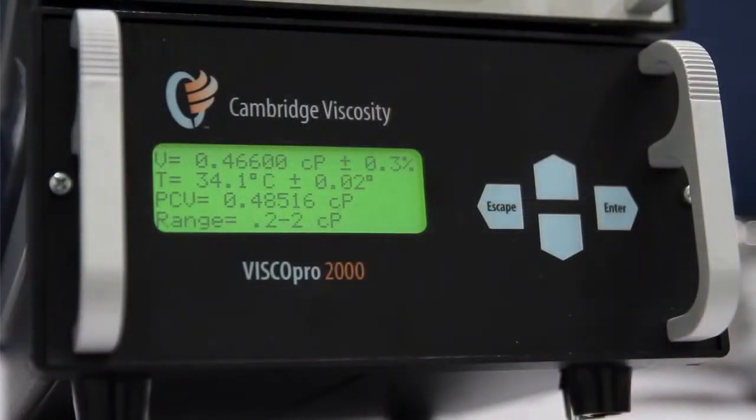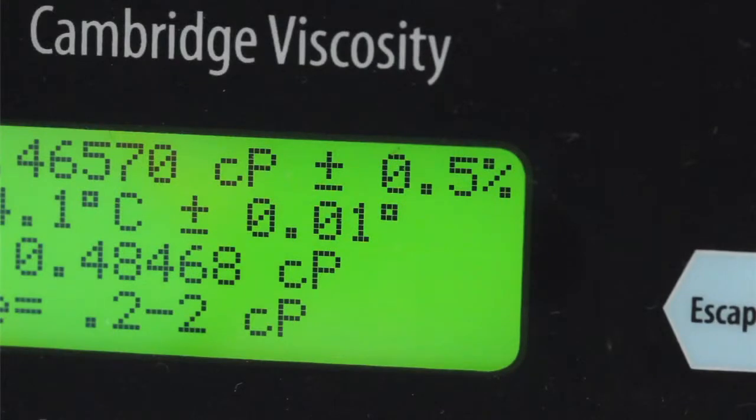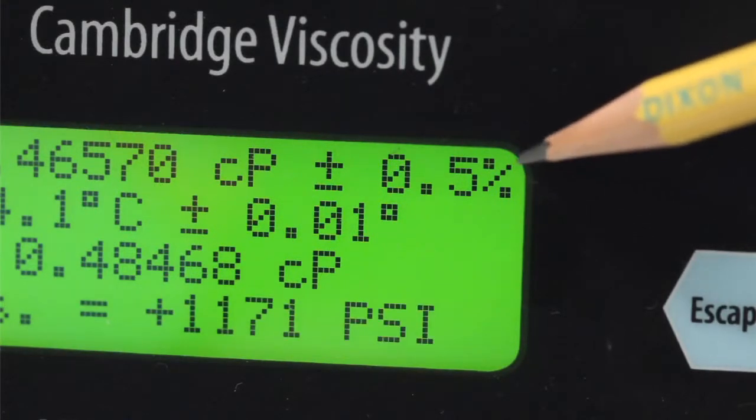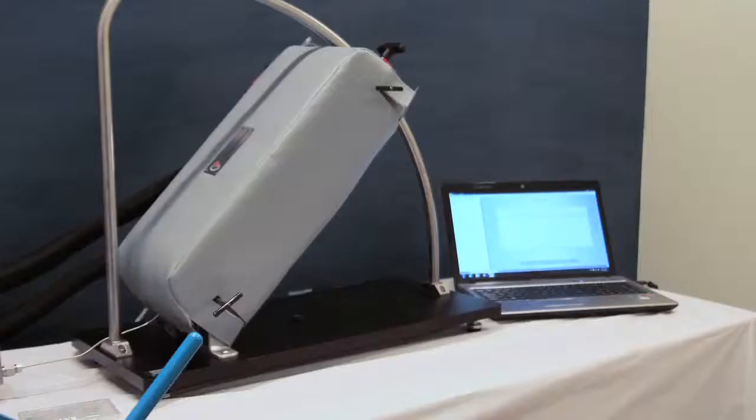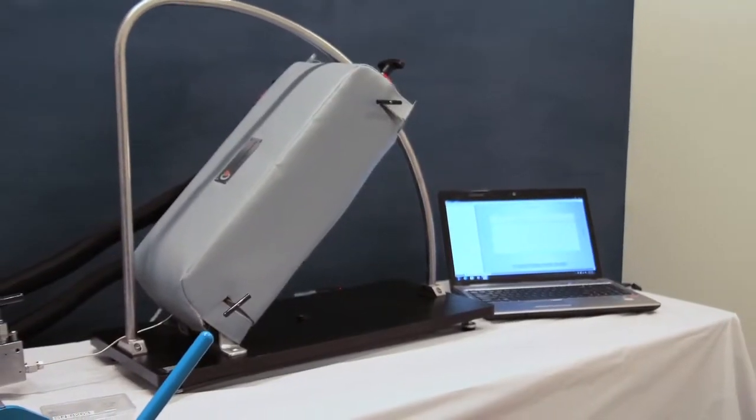Wait to stabilize. Once the viscosity standard deviation has dropped below 1%, your system is considered stable. You have now completed measuring your sample.